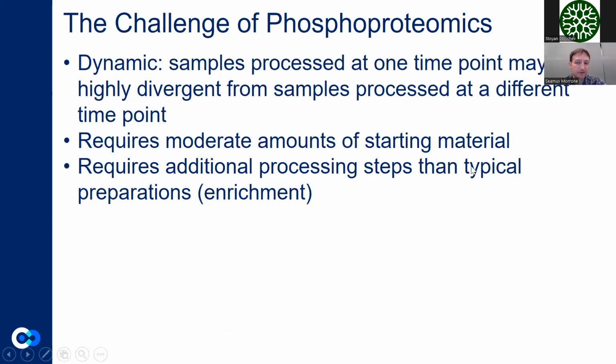And phosphoproteomics itself presents many challenges that are also useful for mass spectrometry to tackle. So as I mentioned previously, it's very dynamic, and samples even processed at one time point may be different from samples processed at a different time point, which requires a very good sample processing technique.